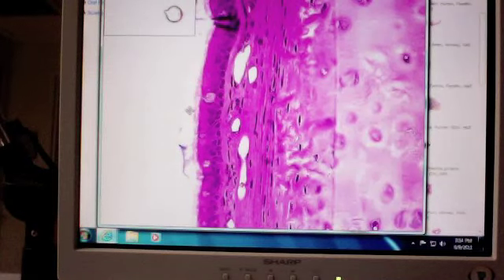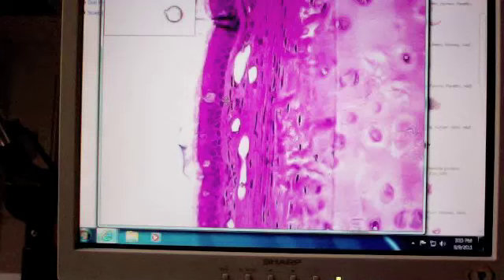I'm asking, epithelium should be included too. I guess I really could ask, my arrow is spanning what structure? All right, and so now we have to say the ciliated pseudostratified columnar epithelium. Right, in this case, my arrow is sitting on the top of what structure?